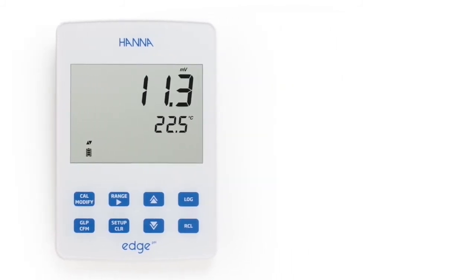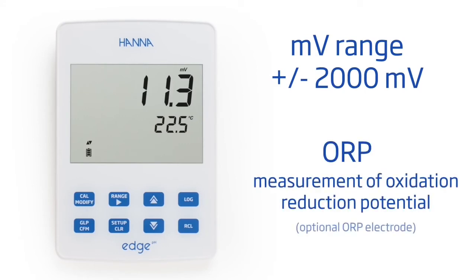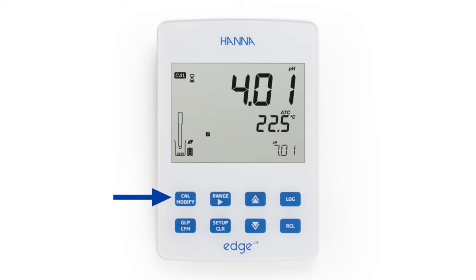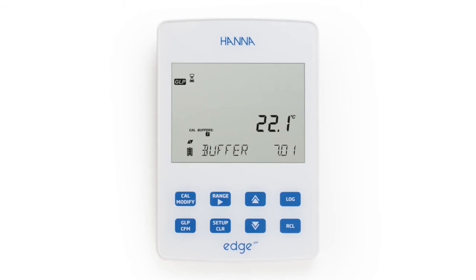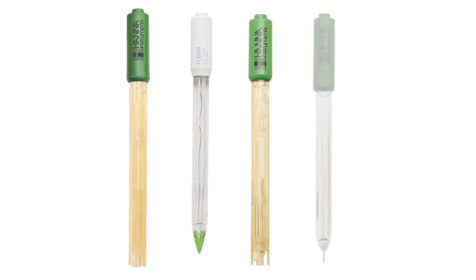The millivolt mode has an expanded range for the measurement of oxidation reduction potential with an optional ORP electrode. Pressing the dedicated cal button allows users to enter automatic calibration. Calibration data is stored on the electrode upon exiting and can be reviewed by pressing the GLP button. The GLP data includes the last calibration date, time, days to expiration when calibration timeout is enabled, calibration points, offset, and slope percentage.